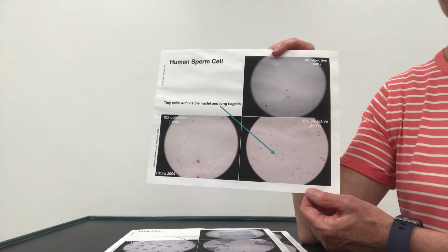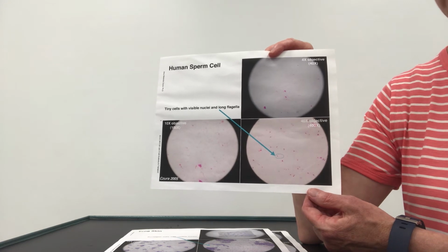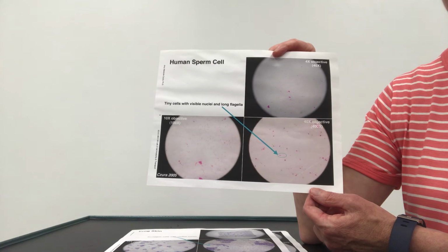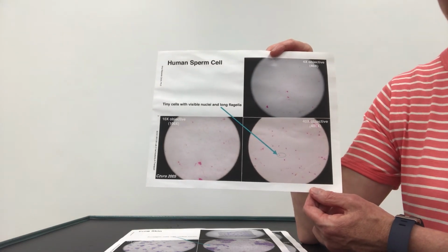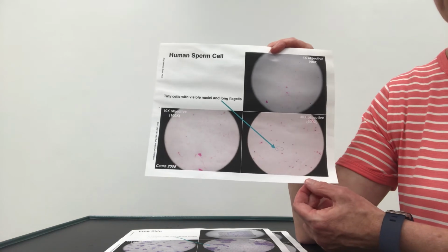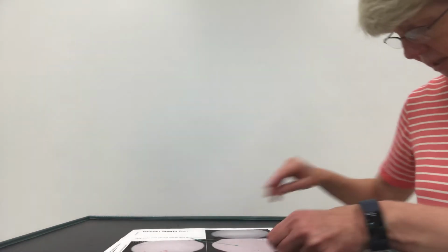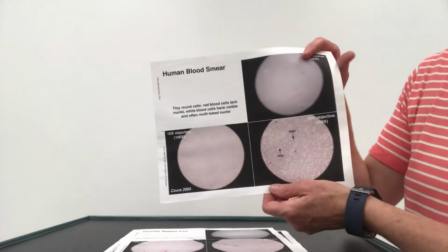Now this needs to be a whole number only, because we're only estimating. We're not good enough to go to decimals. Okay. And you also want to have that number in micrometers. So make sure you can take millimeters, convert it to micrometers, and you understand how to calculate the size of an object.